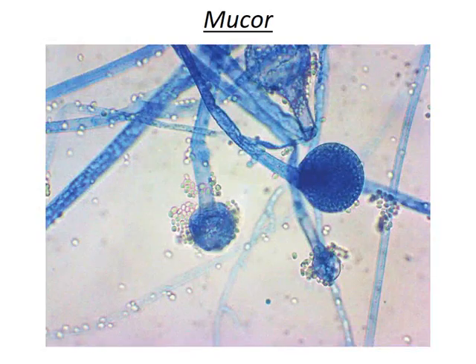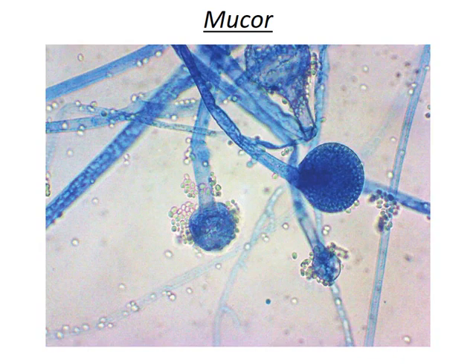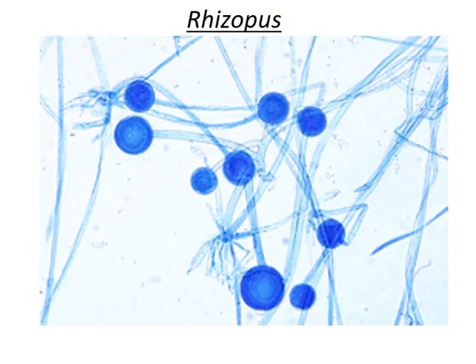This is the structure of a Mucor species. What we can observe under the microscope are the long filaments of Mucor that give rise to sporangiophores. The sporangiophores bear the structure called the sporangium, and within the sporangium the spores of Mucor are present.